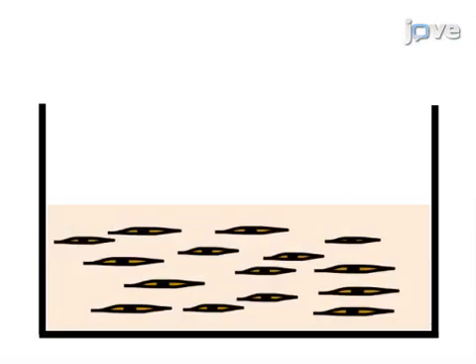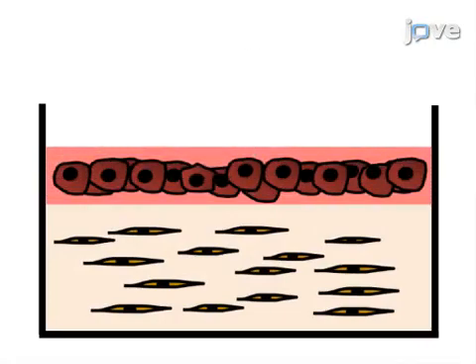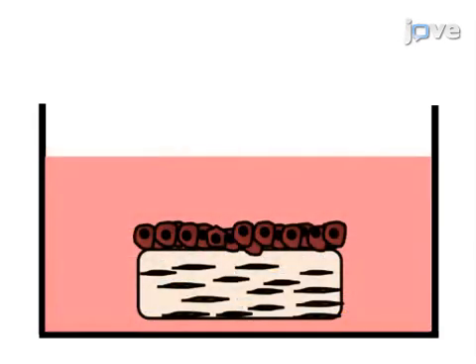Next, lung adenocarcinoma cells are plated onto the surface of each gel to prepare a three-dimensional co-culture of cancer cells and fibroblasts, and the gel is separated from the edge of the well to generate a floating culture.